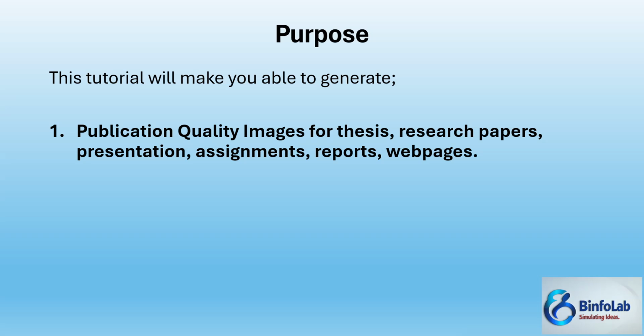After completing this tutorial, you will be able to generate publication quality images. By publication quality, I mean extremely high quality images for your thesis, research papers, presentations, assignments, reports, and web pages, if you are managing a web page or HTML, etc. So you will be able to generate high quality images using PyMOL in Google Colab setup for free.